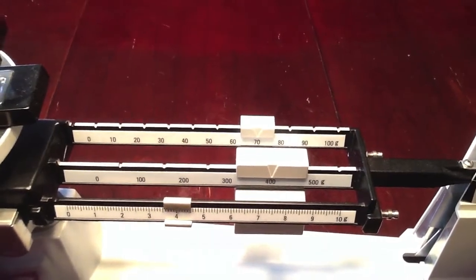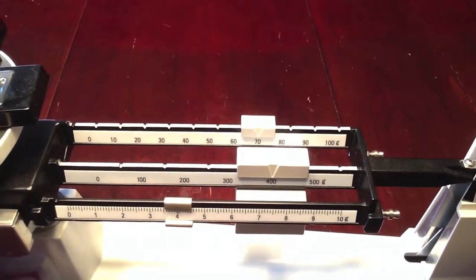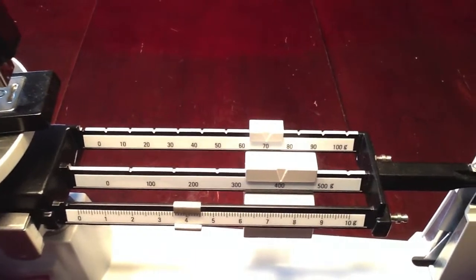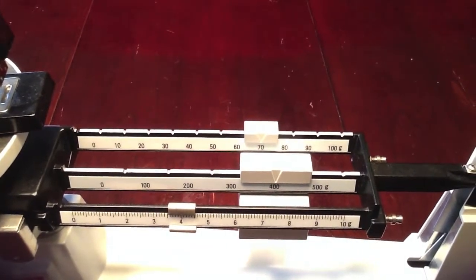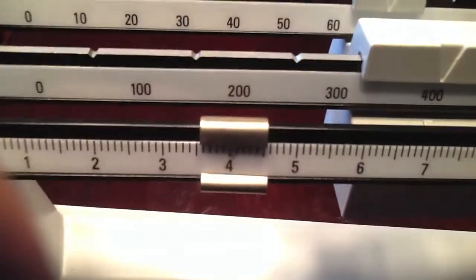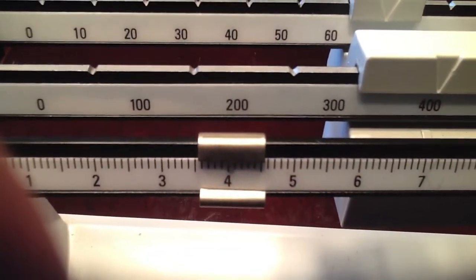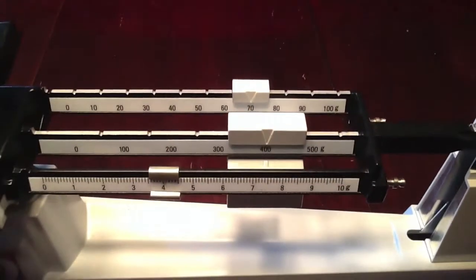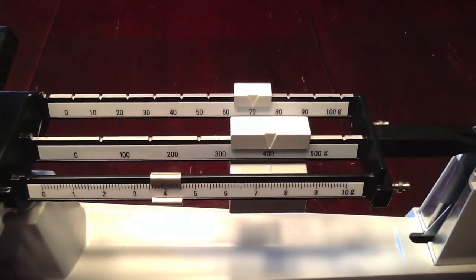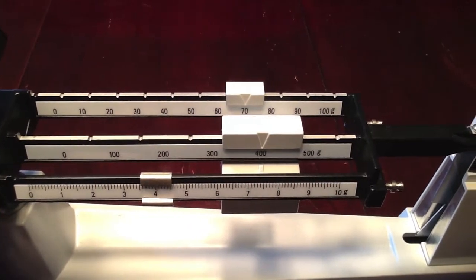Now we need to add and total the three riders together. Our 100 gram rider is at the 400 mark. Our 10 gram rider is at the 70 mark. And our 1 gram rider is exactly at 4 grams. So if we add the three together, we come up with a total mass of our stapler of 474 grams.